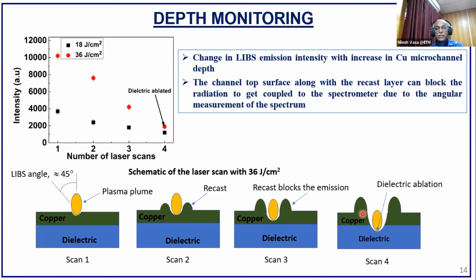And when we reach a particular point in the dielectric, we will end up with ablation of this material. So this technique certainly doesn't give the exact position where we will reach the copper thin film only, because there are so many other thermal aspects which, in spite of the laser ablating only the copper film, may also affect the dielectric. So basically our intention is to go up to a certain position using direct laser ablation.